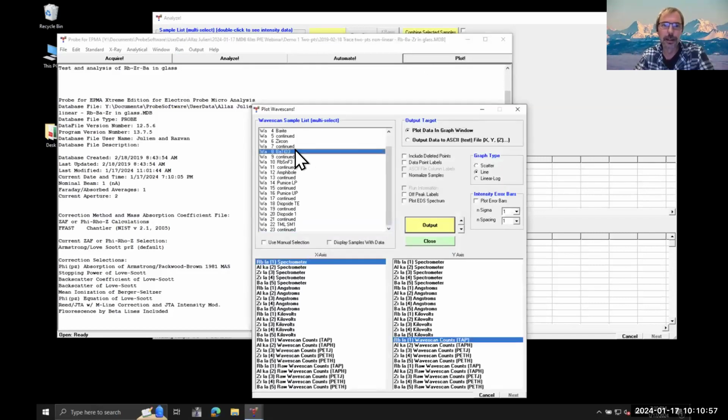So I tested here, and I'm just going to show you a scan of my barium titanium oxide, looking at the rubidium in these standards. I expect no rubidium in it, so that could be a good standard to analyze to test for a blank. That is, can I precisely measure the absence of an element? And that's a quote from Magda Sinovic: if you want to do something very, very good in terms of trace element analysis, you first must demonstrate that you can precisely measure nothing.